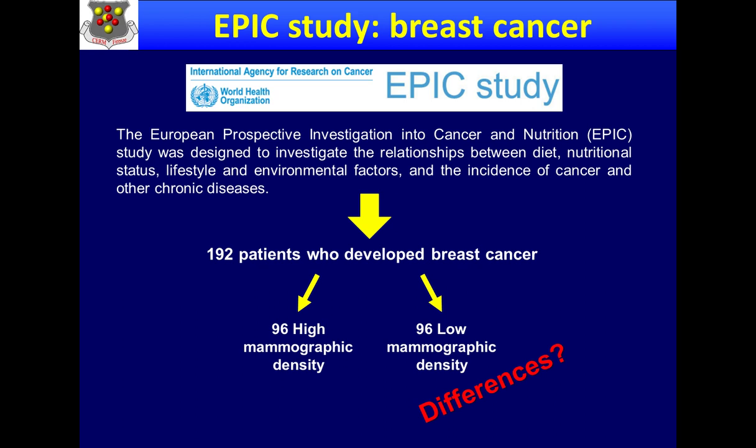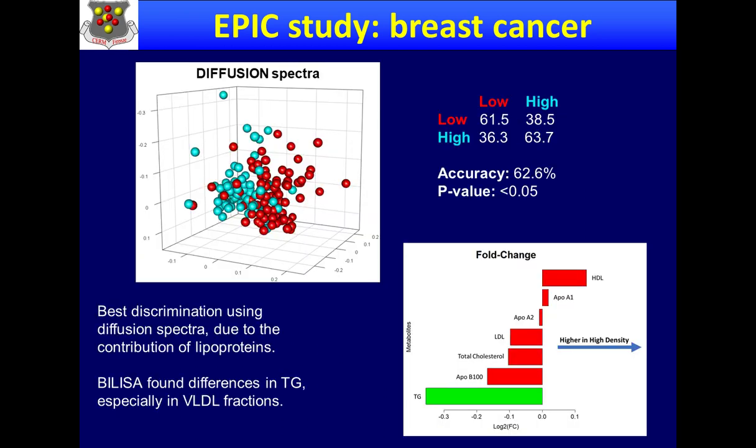And then this is a study that was a big European study, of which we got a few samples as a small side project here in Florence. And we were looking at women with breast cancer, and the collection was very large, so we were given only 192 patients who had breast cancer, because the idea was to see whether there was a difference between women with high mammographic density, which is known to be a risk factor for breast cancer, and low mammographic density. So this was a very challenging project, and I think it's still challenging, because maybe there isn't any difference.